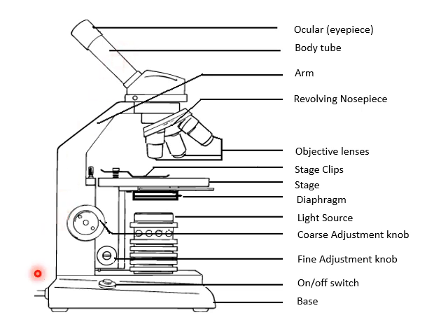Alrighty, so when you get your microscopes in class, you take a quick peek, just make sure the wire is all safe, make sure the lenses are in good working order here, nothing's cracked, it's not too dusty, although who knows after Christmas holidays how dusty things are going to be. So we'll take a look.